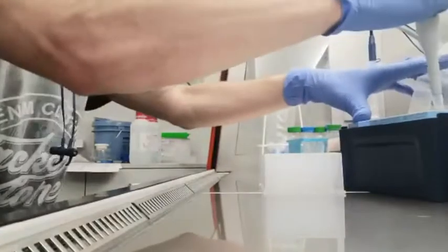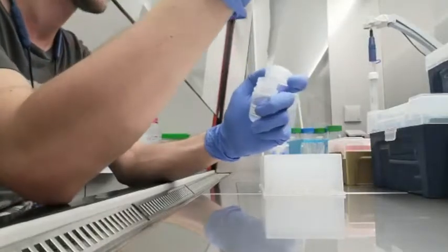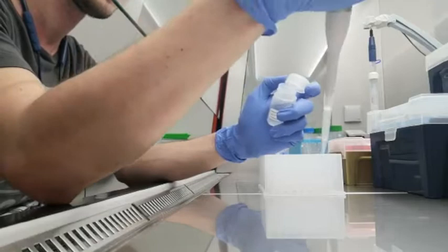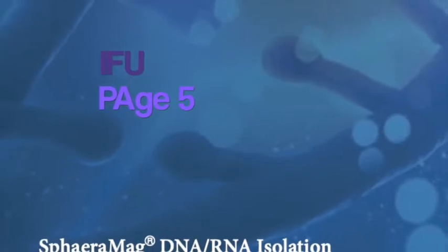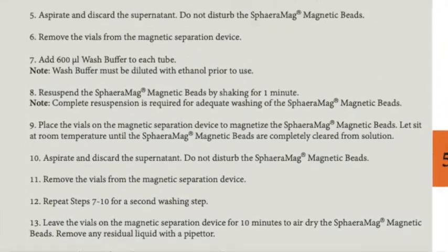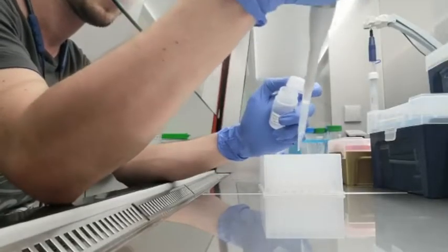When you are done pipetting your samples from the original sample container, including the VTM into your lysis buffer, add the beads. Instructions on how much volume of a sample should be used can be found in the IFU. In general, 200 microliters of sample, including the VTM, should be used per extraction. 10 microliters of bead should be added to each sample well.